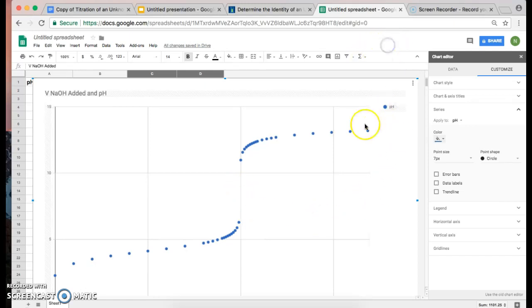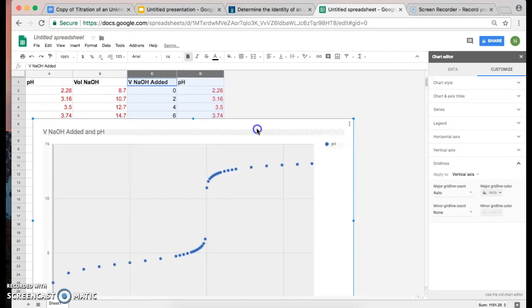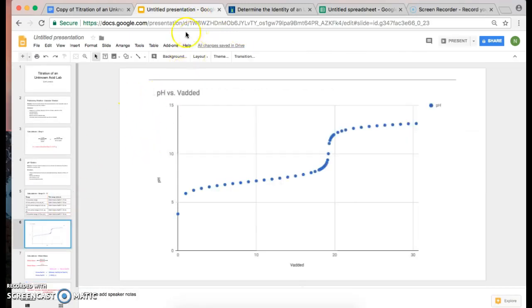Let me see if I can show you the x-axis as well. Okay. So my value should be somewhere on this 20 line or near this 20 line. Now, with that being said, what is that useful for? I can utilize that information in the following calculations. This piece of information is good for two things.